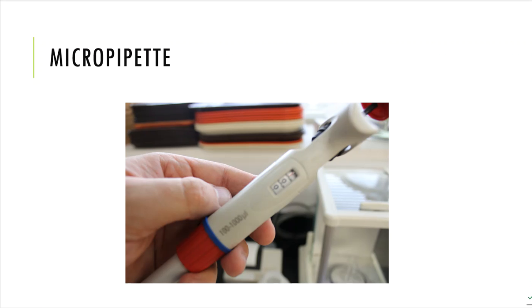So instead of using volumetric pipettes and graduated cylinders, which are not accurate, beakers, which are not accurate, volumetric pipettes would be accurate, but volumetric pipettes tend to be very, very finicky if you're not used to them. I decided to make this process a little bit quicker and a little bit more relevant. And the way that I did this is to use what we call a micropipette or a micropipetter. Some people in biology world also call these pipettemans.